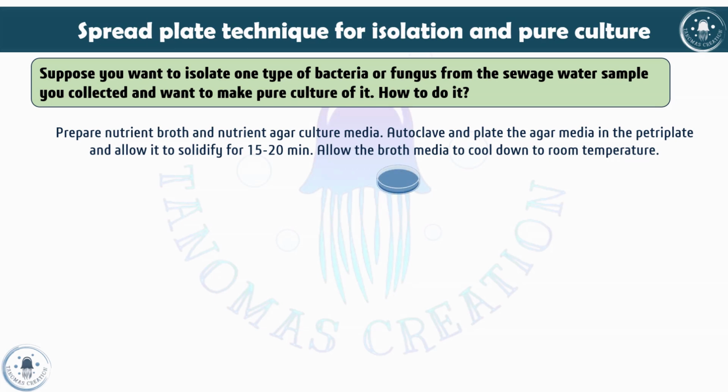Do not use the broth when it is hot, because after autoclaving the broth will get hot and the temperature will rise, so you need to cool it down to room temperature before you use it. Now you do the isolation.